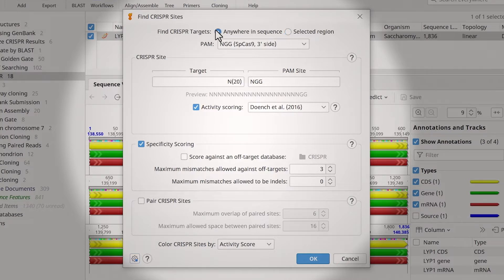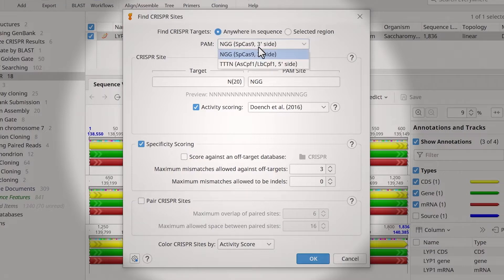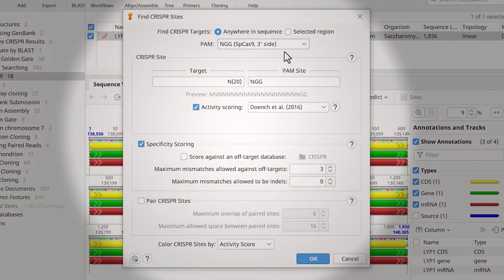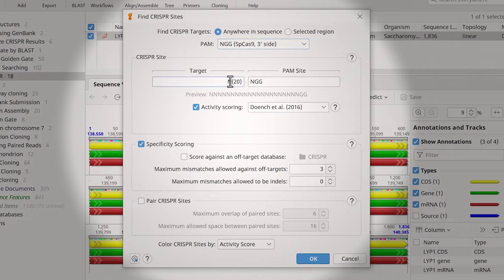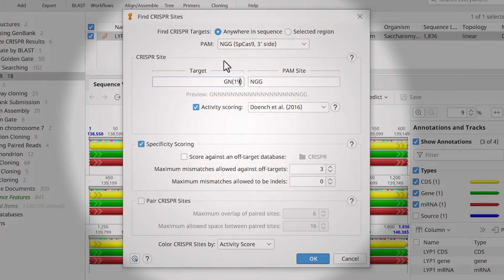In the PAM drop-down menu, specify the 3 Prime End Cas9 option. Next, use the target and PAM site fields to input the motif you want your CRISPR sites to match. For this example, I will search for a target of GN19 and a PAM site of NGG.